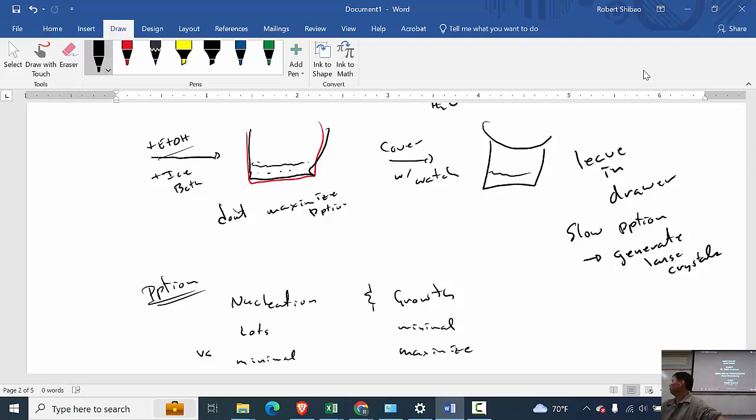Okay, just a reminder that we have an eye wash over there, plus the safety shower, and at each sink we have an eye wash and a handheld shower. Normally we put the waste in that last hood that's lit up there, so if you have waste, dump it in the waste jug back there. In a normal lab, I just have a waste beaker at the lab station, so I only go at the very end, like in the video, to dump the waste.